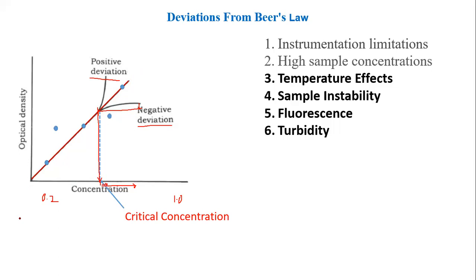Right. So what I'm trying to convey with this graph is that you should consider those points, like in the last lecture, if you remember, I told you this: if you're not getting all the 5 points on the line, which points should you consider in order to draw the straight line?